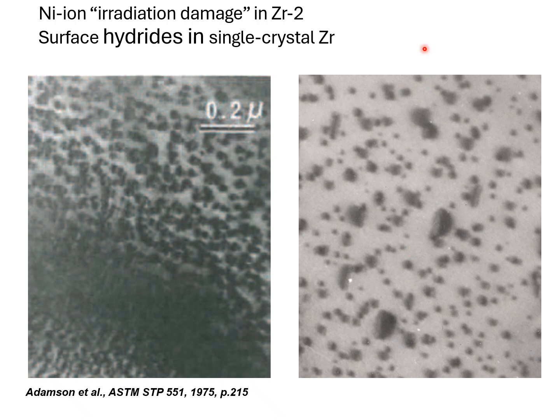And basically, my question to them was, based on my experience, they don't look like loops. They look like hydrides. I asked, how do you know that they are loops and not hydrides? If they had any concern, they could do some stereo microscopy to show that these are hydrides, because this isn't irradiated, it's just a polished zircaloy sample. They could show that these were on the surface. That is, they're an artifact, produced from the polishing.